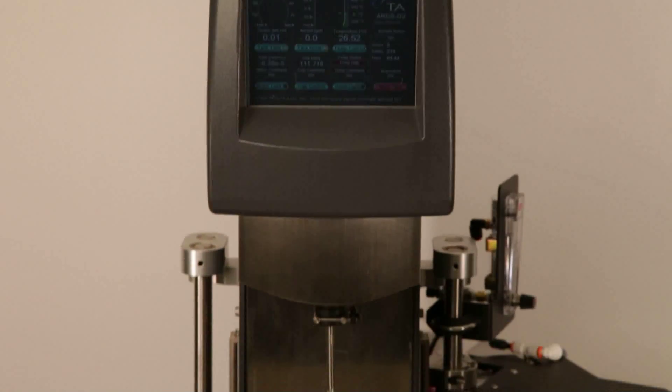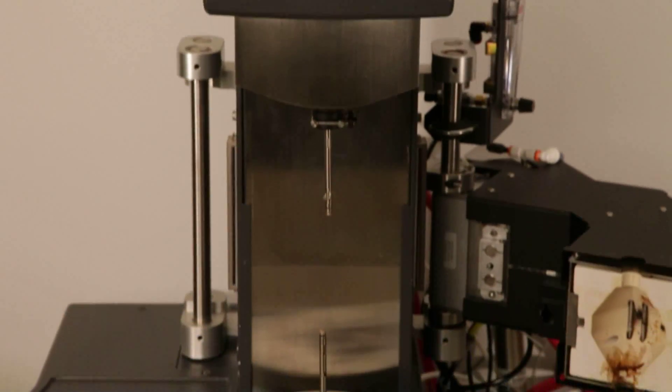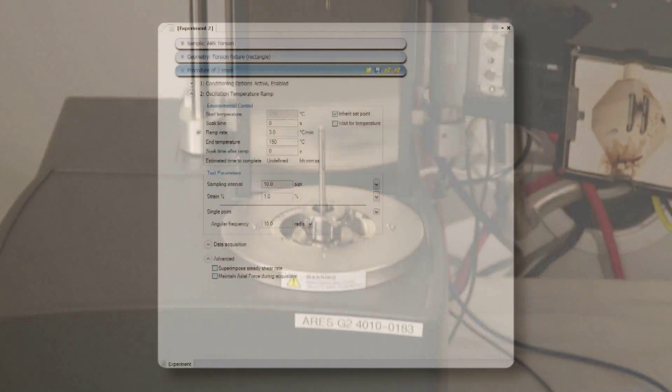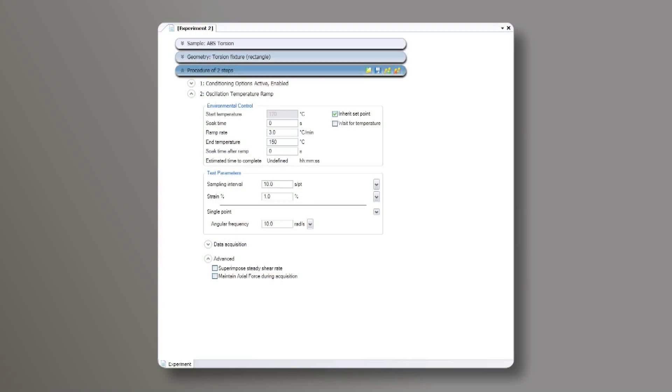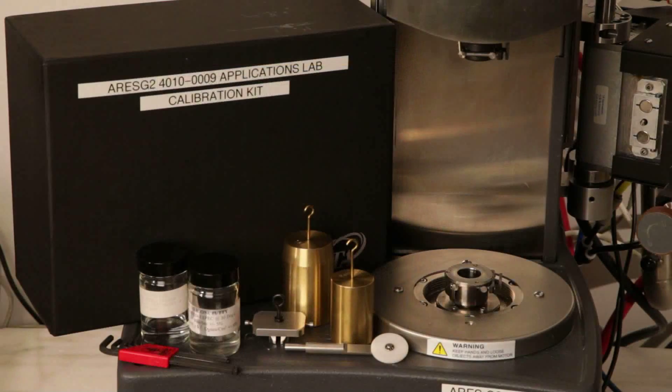First, ensure that the ARIES G2 is fully enabled, communicating with the TRIOS software, and you have a complete calibration kit.